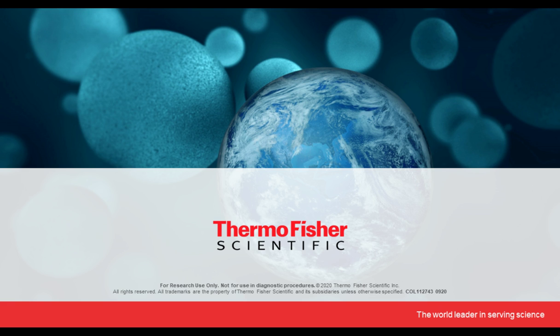You can then, after probing, take an image right away, or if you want, you can go forward with your entire experiment of blocking, primary antibody, secondary antibody, and so on, followed by detection, and then you can take images at the end of the No-Stain signal as well as your target protein signals. And the No-Stain signal is stable and it will last throughout your experimental process. So you have the flexibility of doing it either way.